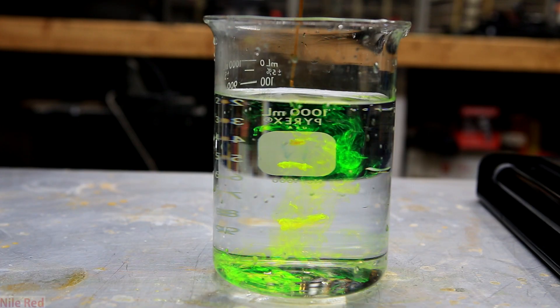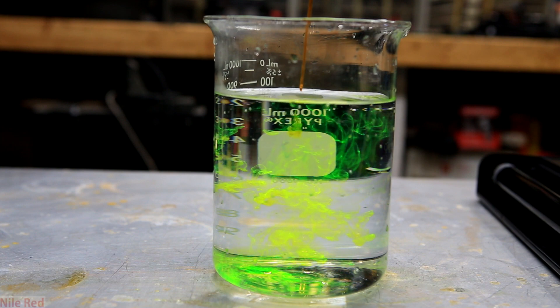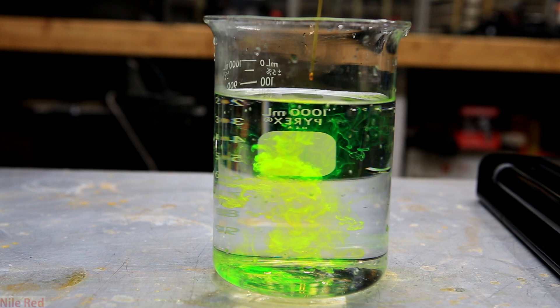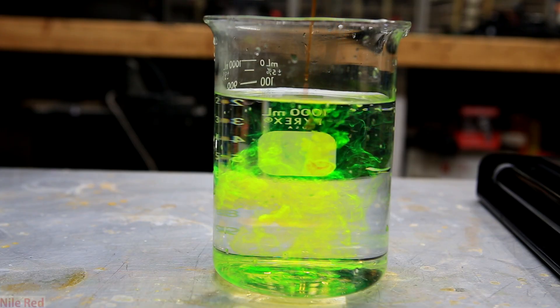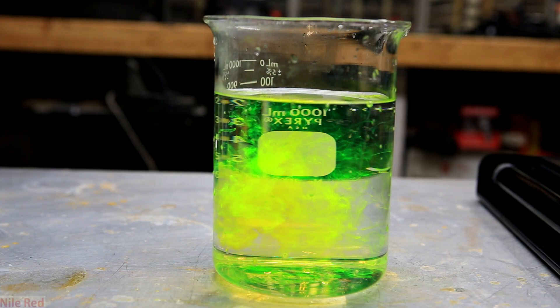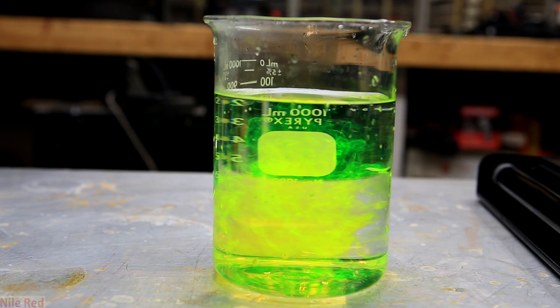In this shot, the effect is highlighted even more where you can see it's a red liquid in the pipette, but the moment it goes into the water, it turns green. In the pipette, the concentration is high enough for it to quench its own fluorescence, but when it's dropped into the water, the concentration is decreased and we can see the nice green fluorescence.